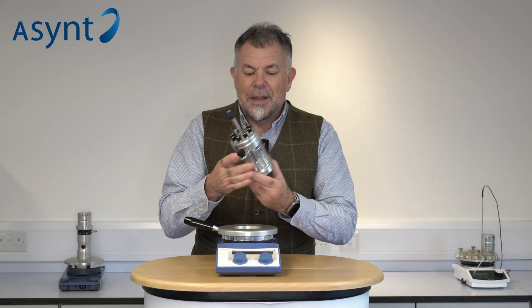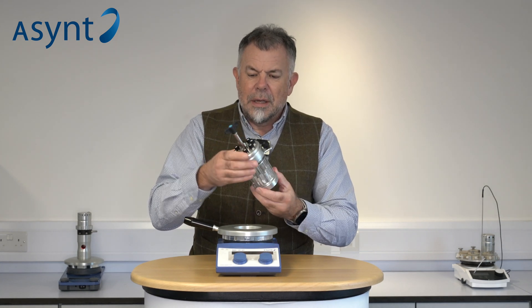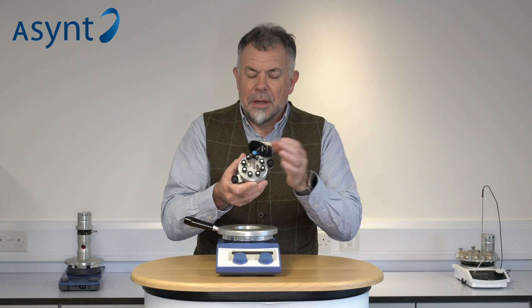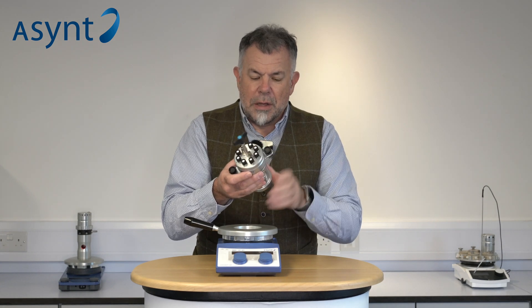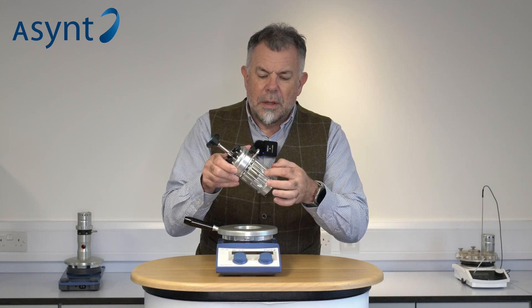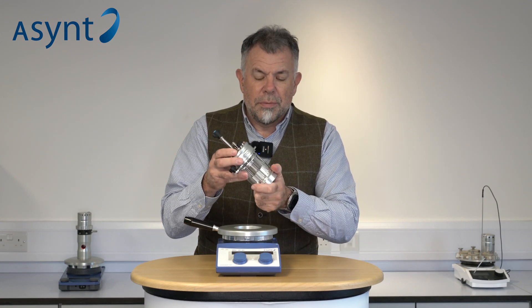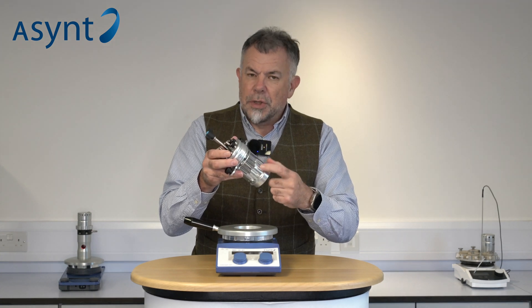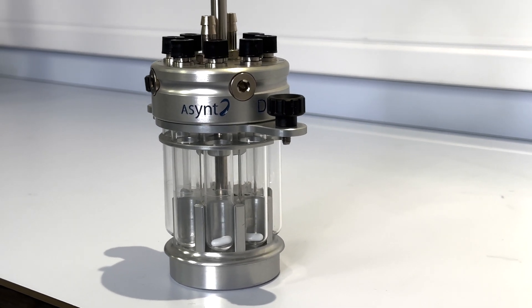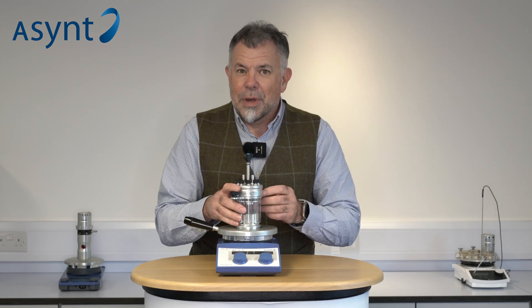So with the Illuminate we still have an Octo reactor, but here it's slightly different. The same sealed reactor top, so you've got inert atmosphere, the ability to take samples and make additions, and the shortened tubes. But here the block itself is cut away on the sides so you can still have good temperature control through the tubes, but the sides are open. The reason for that is because we shine a light from outside in.